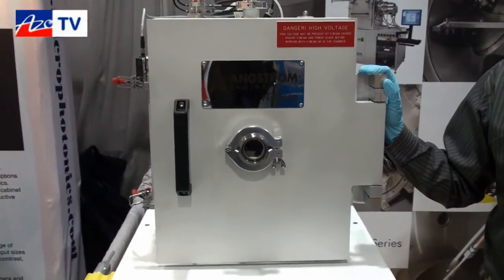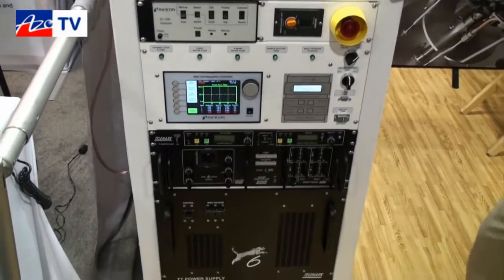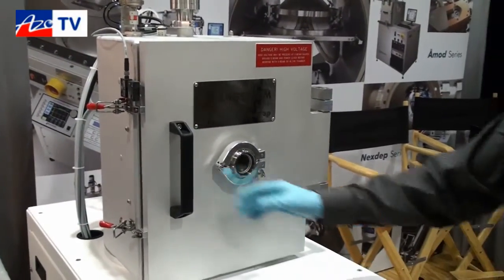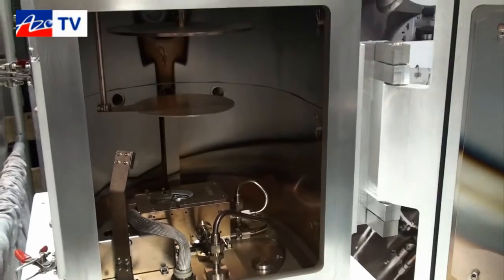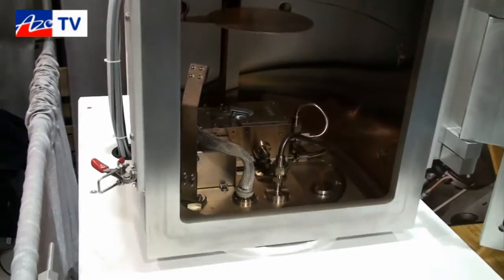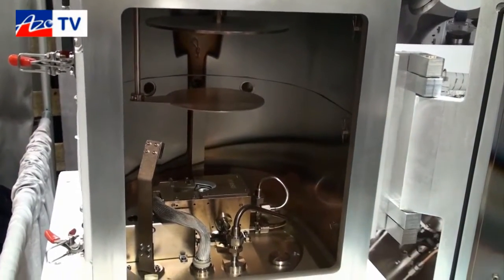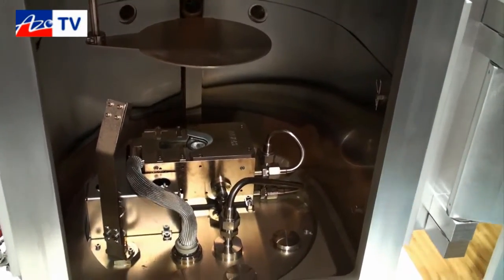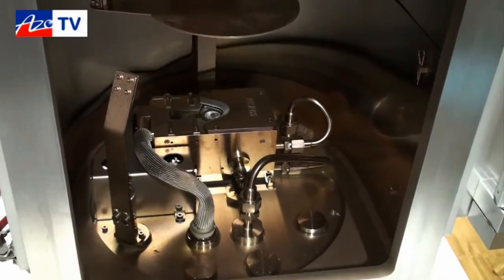Two of the things that set this tool apart are safety and process repeatability. We have Class 4 safety rated switches to make sure that when users open up the chamber, we cut all the high voltage and high current to the system. We also cover all of the high voltage cables and provide a grounding probe to make sure that all the voltage is dissipated before users go in to clean out the system or add new material to the source. This is really critical because a lot of other systems don't put the same effort into protecting the users. There are voltages present here that can be hazardous — can kill people — so a lot of engineering goes into making sure the control system is safe.